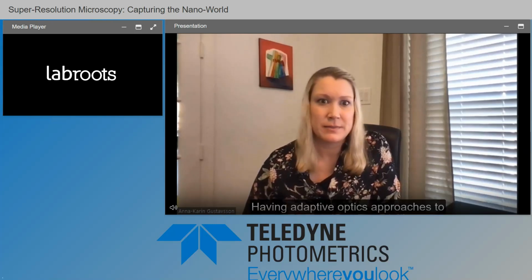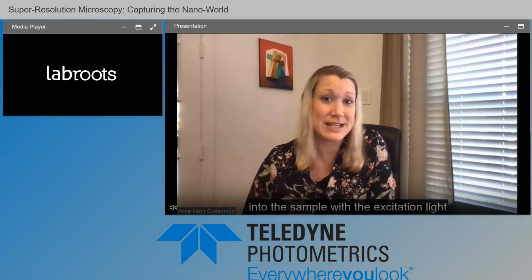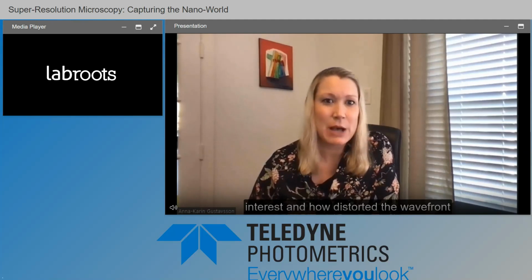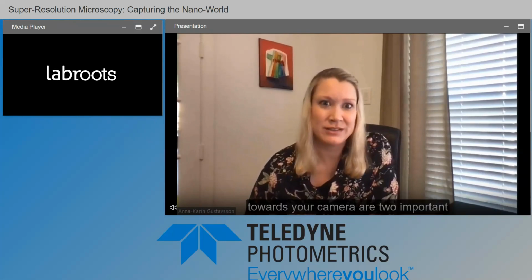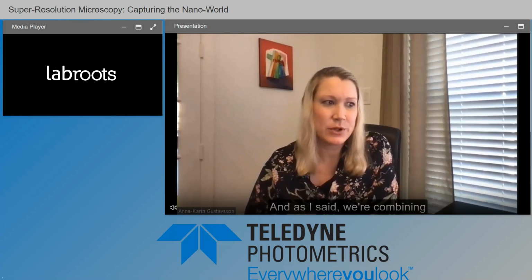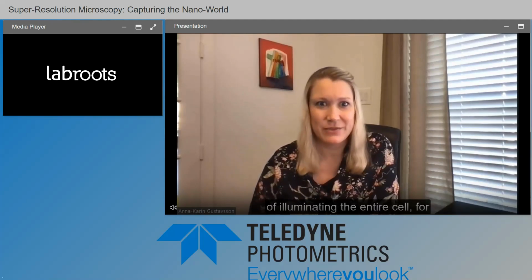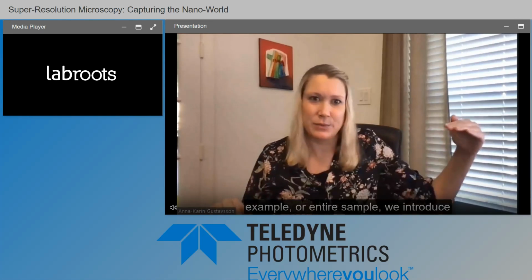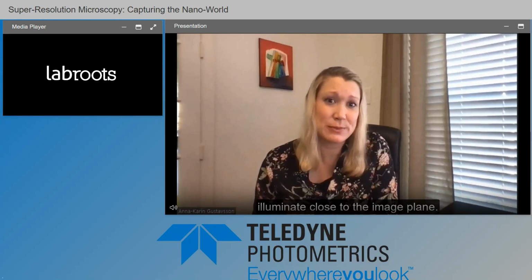So having some adaptive optics approaches, both to improve how well you can penetrate into the sample with the excitation light and actually reach the fluorophores of interest, and to correct how distorted the wavefront is of the light that is emitted back towards your camera, are two important factors that we are considering. And as I said, we're combining other approaches with light sheet illumination in our lab, where instead of illuminating the entire cell, for example, or entire sample, we introduce a sheet of light to optically section the sample from the side and only illuminate close to the image plane.